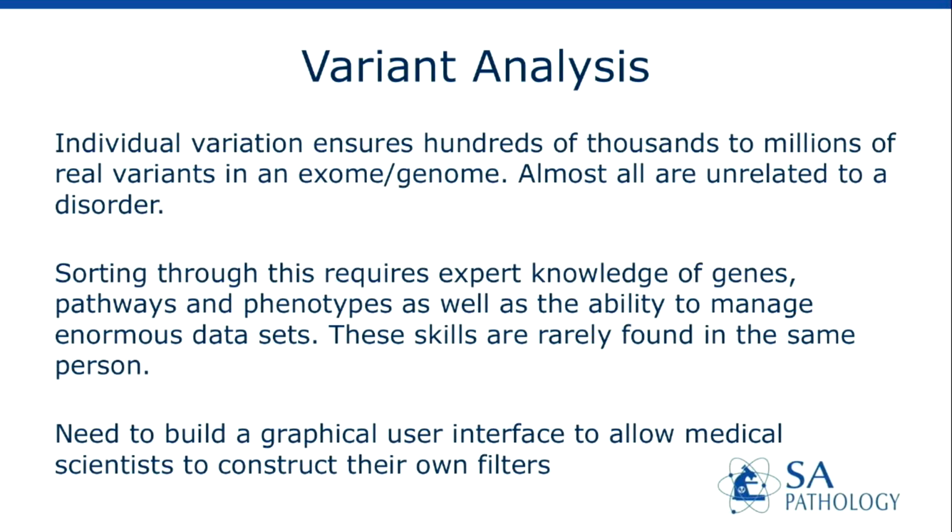To search through this is not easy. It's like a mini research project. You have to know about the disease, how common it is, the family history. You end up going and looking through the literature. So there's a team of people called medical scientists who basically do this investigation. The goal of this program is to allow those people to run their own filters on huge data sets, because they've got excellent medical knowledge, but they're not going to be able to run Jupyter notebooks or something.